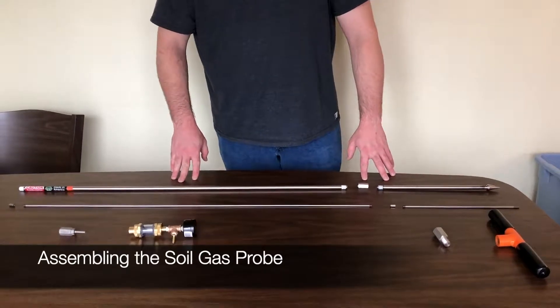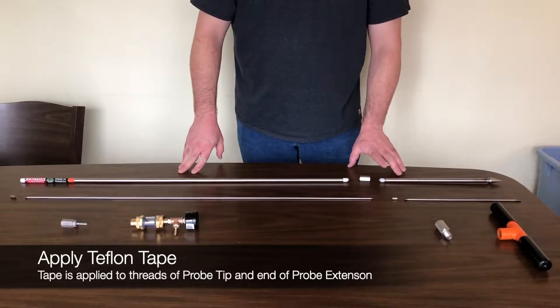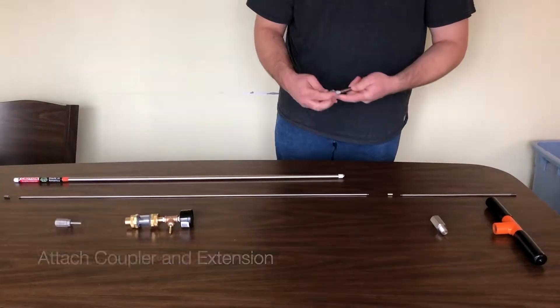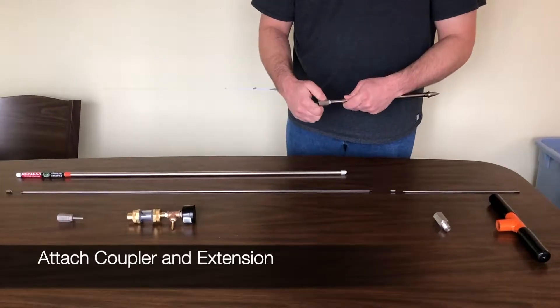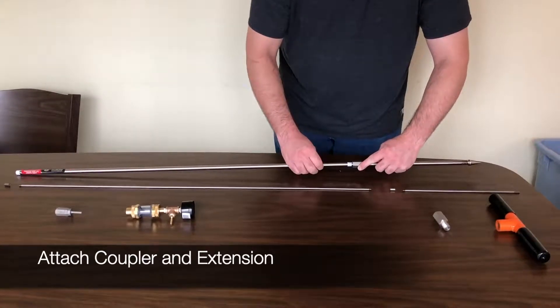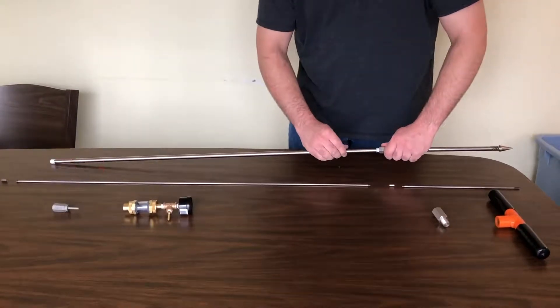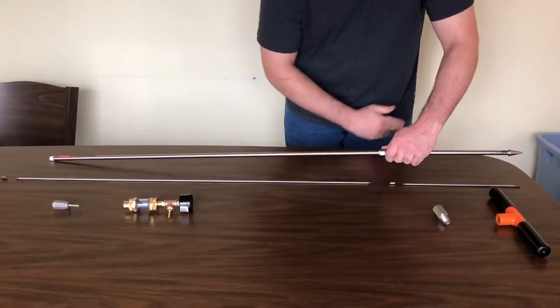To assemble the AMS soil probe, we will need to apply Teflon tape to the threads of the probe tip and one end of the extension. After which, we attach the coupler and the extension. If at any point you need to disassemble a probe and reassemble it, I would recommend applying new Teflon tape.